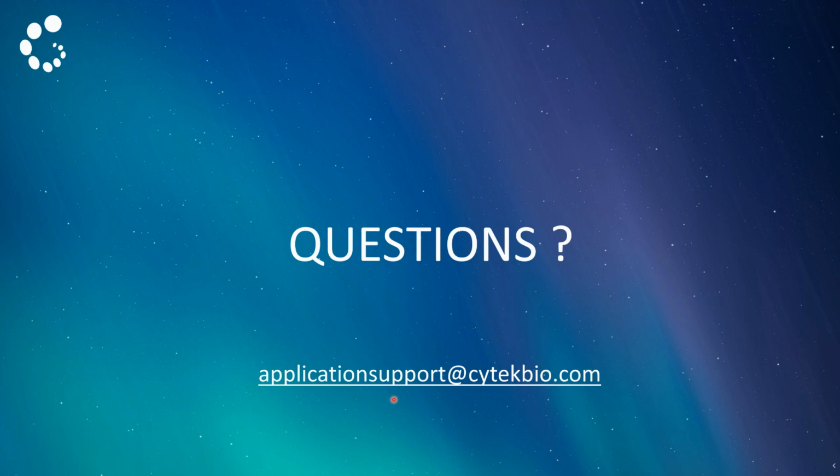Okay, great. Thanks a lot for that one. I think we have time to squeeze in one more question, and that is, can you import and use experiment templates between identically configured instruments? Yes, you can, and it's super simple. Just export those templates. If you have an intranet or if you have a memory stick, whatever your facility allows you to use, and then bring it to the other instrument, and you can import.